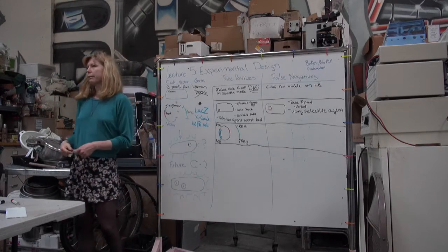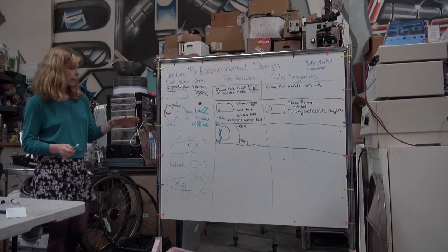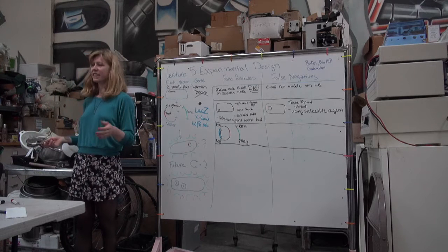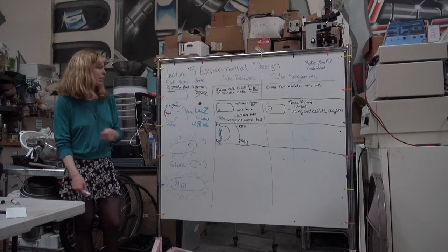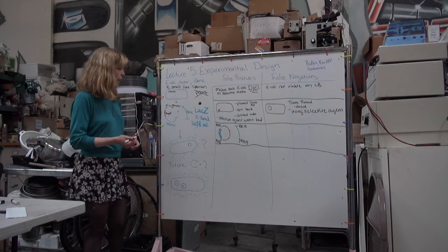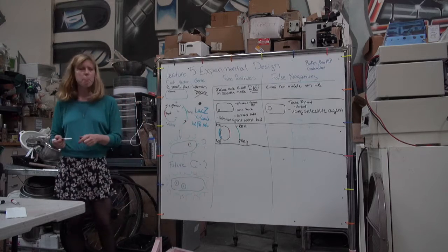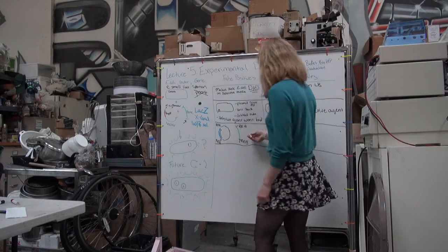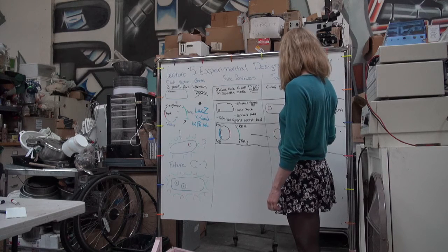Now, something that can happen with this process is that when we cut our vector, not all the original pieces get cut. Not 100%. And the same thing will happen with our gene of interest here. Okay. So in our reaction mix here, we're going to have some whole pieces.